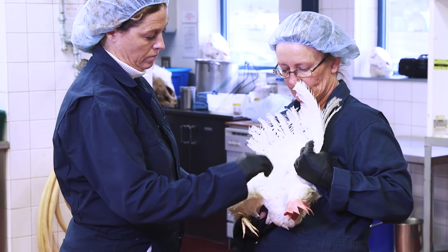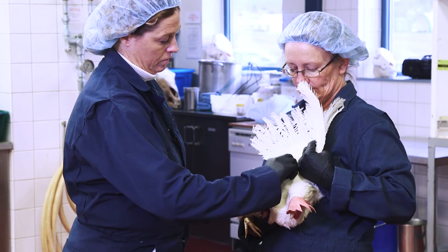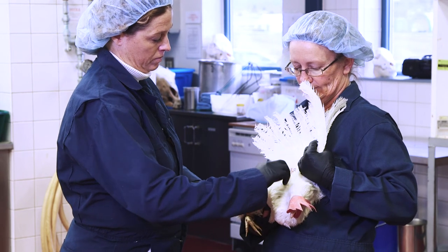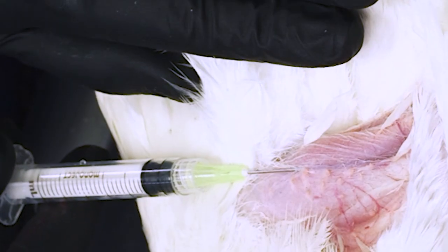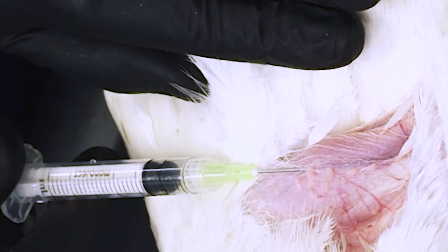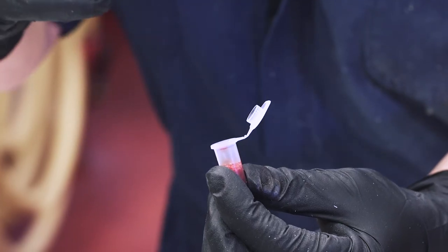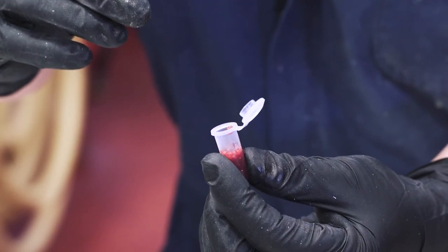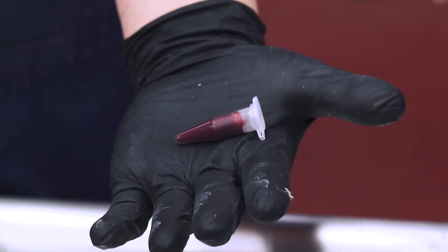If you're not using a table, the assistant holds the bird still against their body, restraining the feet at the hocks with one hand, and lifting the outside wing with the other hand. Again, the angle of the needle insertion should be nearly parallel to the brachial vein. When complete, transfer the blood sample into the collection vial, then close it and lie it flat to allow the blood to spread out and clot.